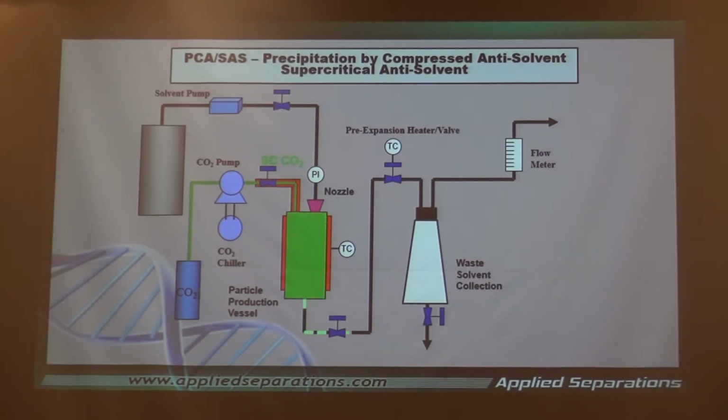So here's what we're going to do this time. CO2 is going to flow. We do this on a dynamic basis. Now you can see what's going to happen here. If you've got a lot of solvent, this is the way to carry it away. And the rate of flow here is very important in terms of the amount of solvent that is immediately going to be pulled out of solution and causing precipitation of the solute. So if we continue this, now we introduce our solvent and solute.